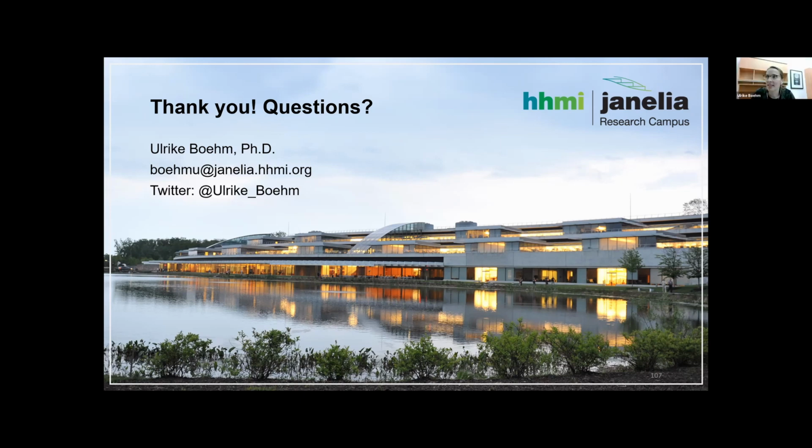I used to work in a lab in Germany, which started out with correlative microscopy, which tried to marry fluorescence microscopy and electron microscopy.